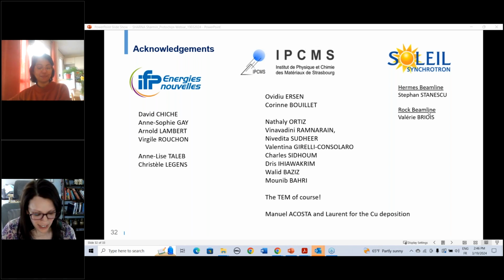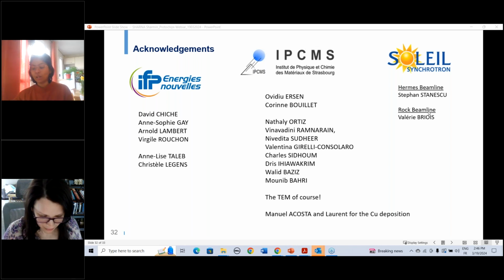The next question is, did you notice any beam effects, or would you expect any of these processes to be beam sensitive? No, typically the material we have used was in STEM mode, so the beam was already quite low, and for the observation, we did not do continuous exposure to the beam. So I wouldn't expect this phenomenon to be related to the effect of the beam.